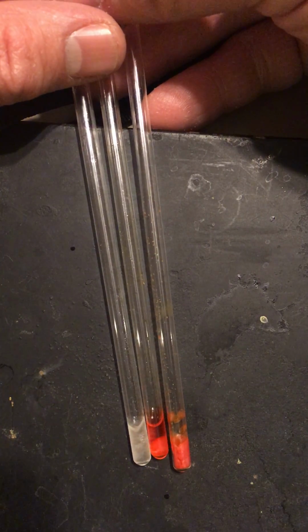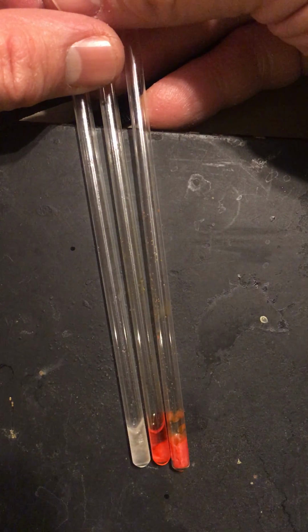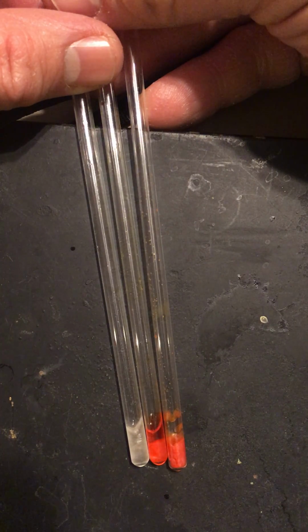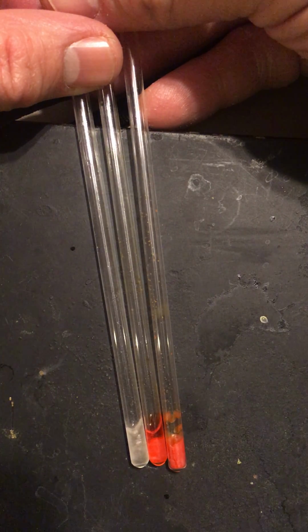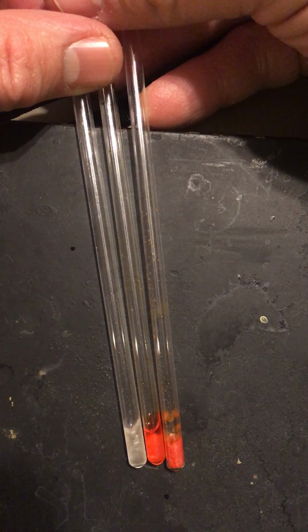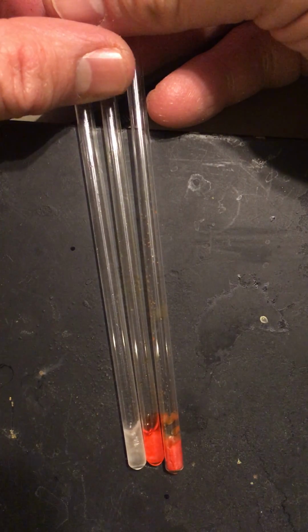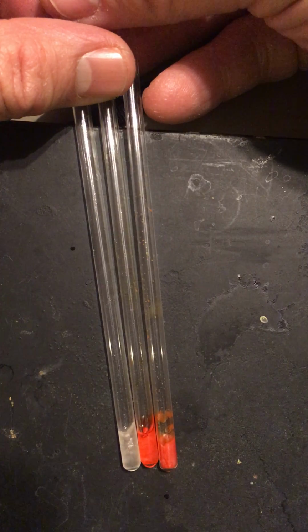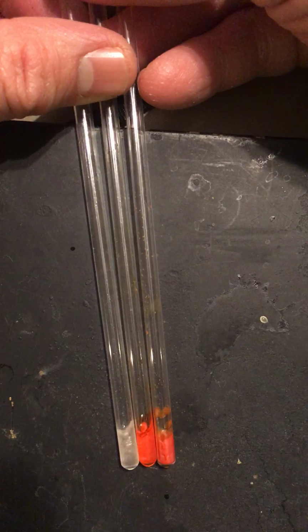So what we have here is an example of pure sample, the eicosane, with a little bit of impurity, azobenzene, added. And that eicosane's freezing point gets depressed so that it can be melted at near body temperature. And so this is an example of freezing point depression. Other examples of freezing point depression include adding sodium oxide to silicon oxide to help make soda lime glass.